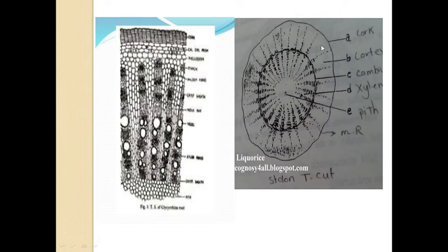This one is known as cork. This one is the cortex portion, cambium. These are the xylem. This one is the xylem portion, pith, and these are the medullary rays. Such type of structure you will find under the microscope.